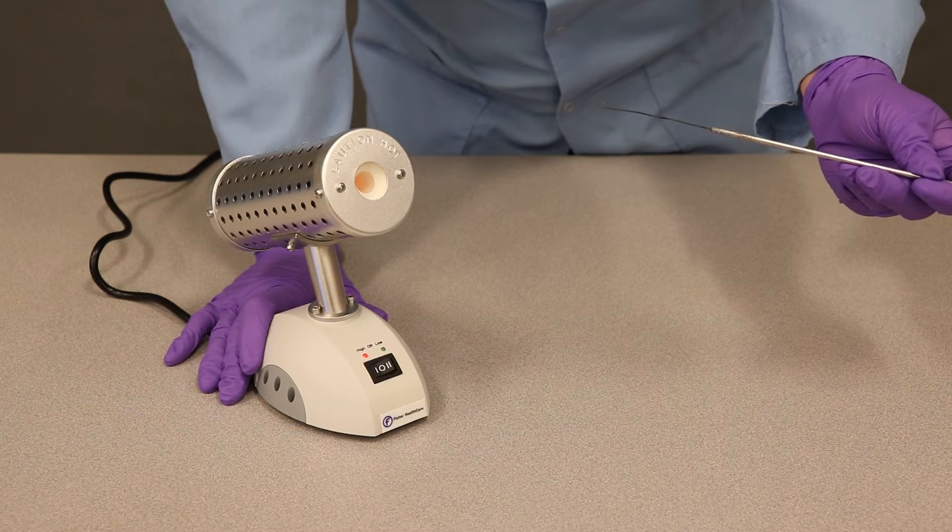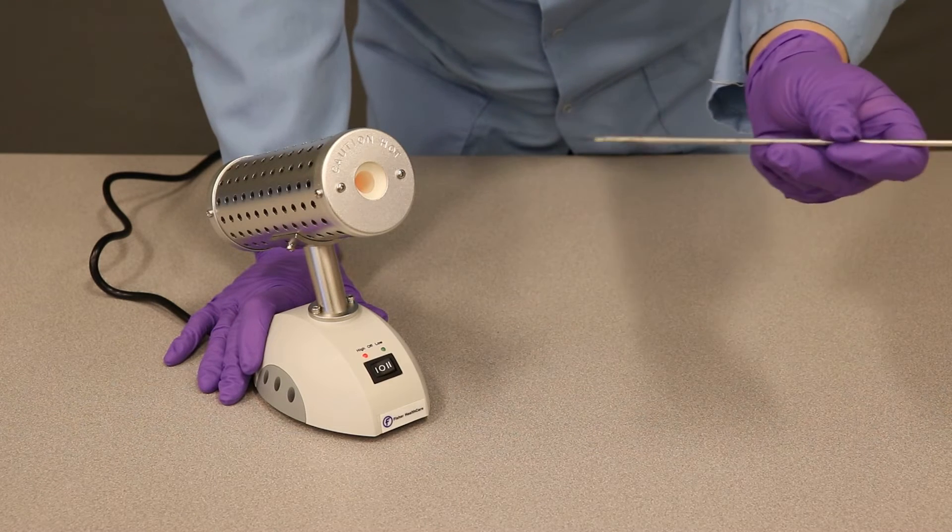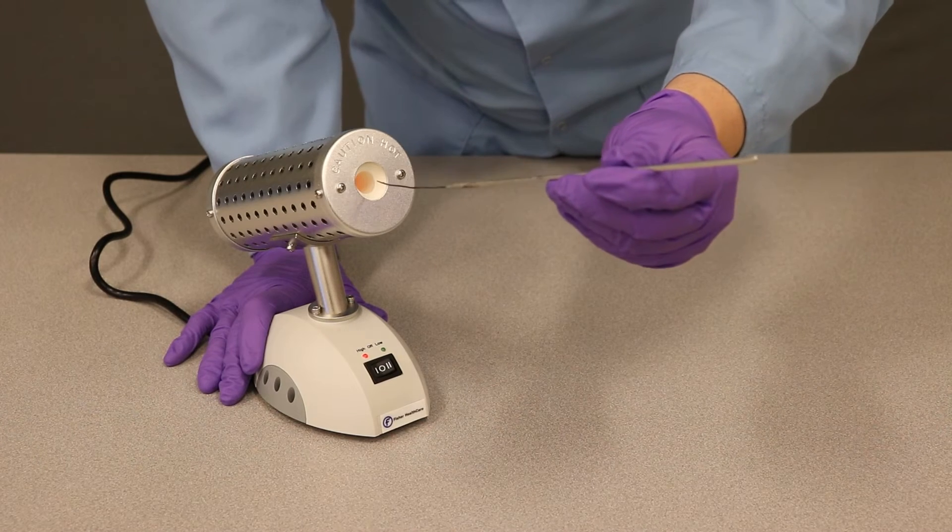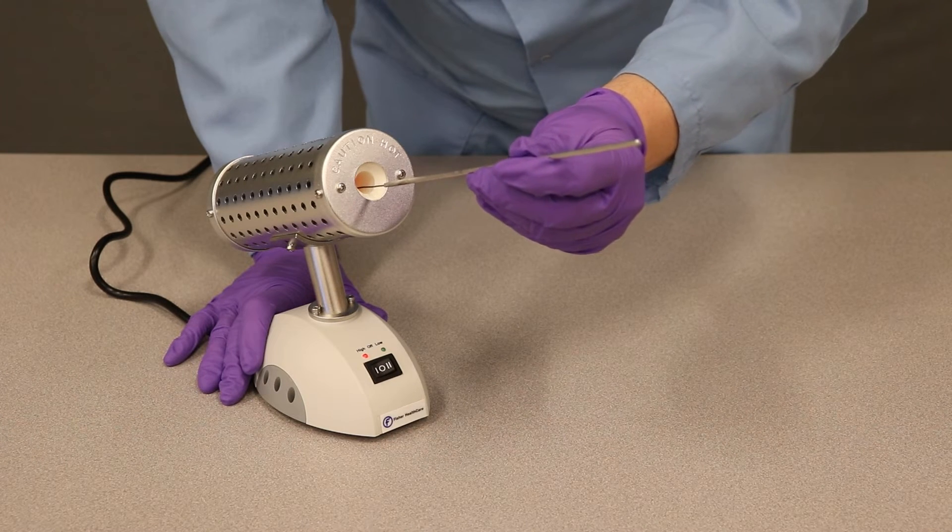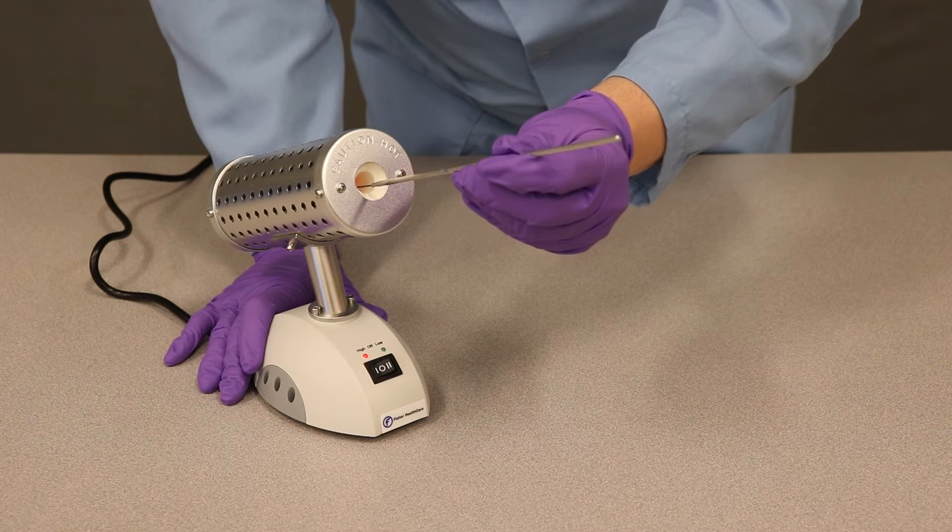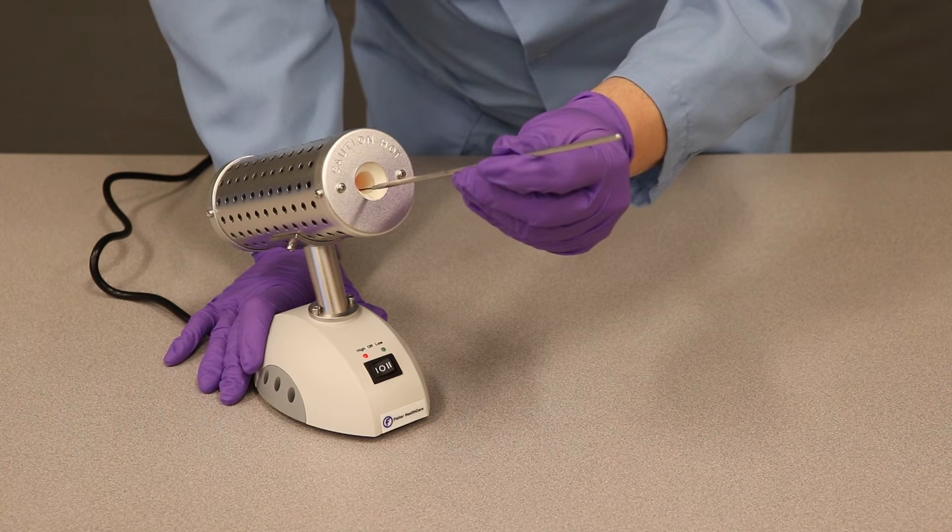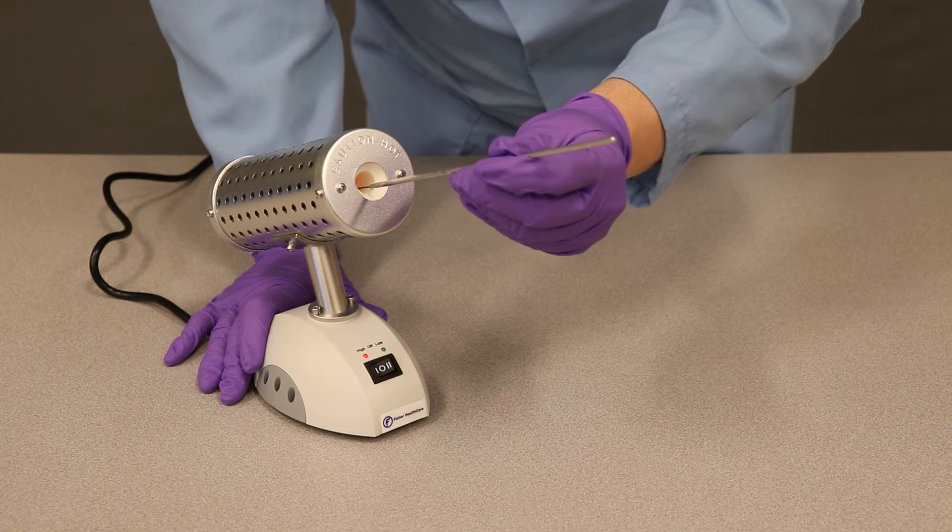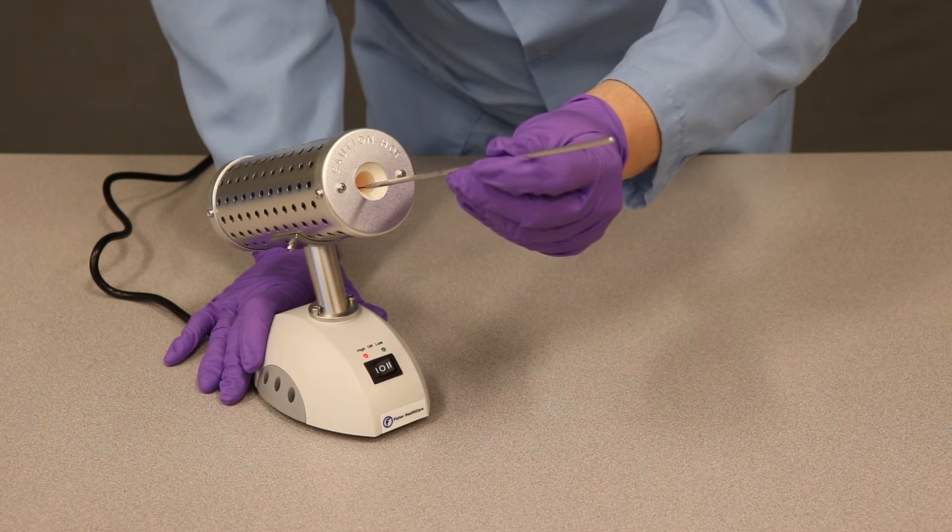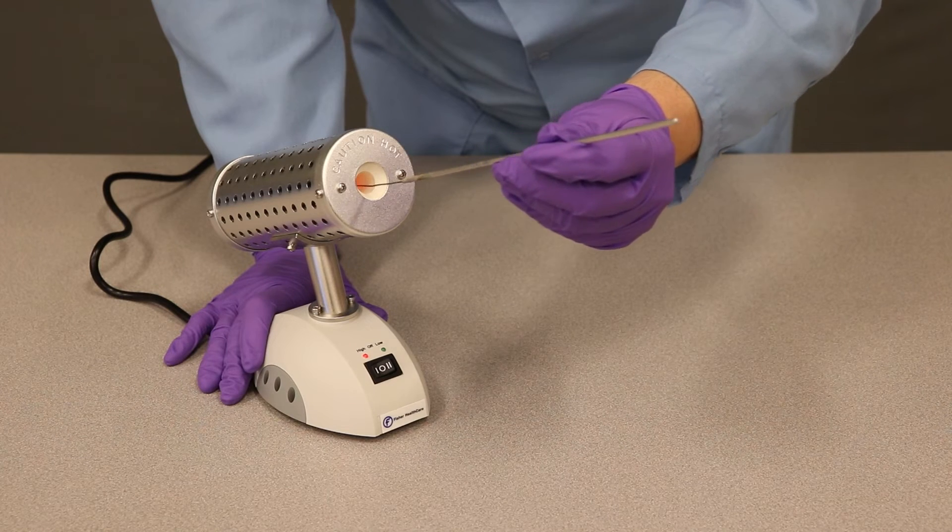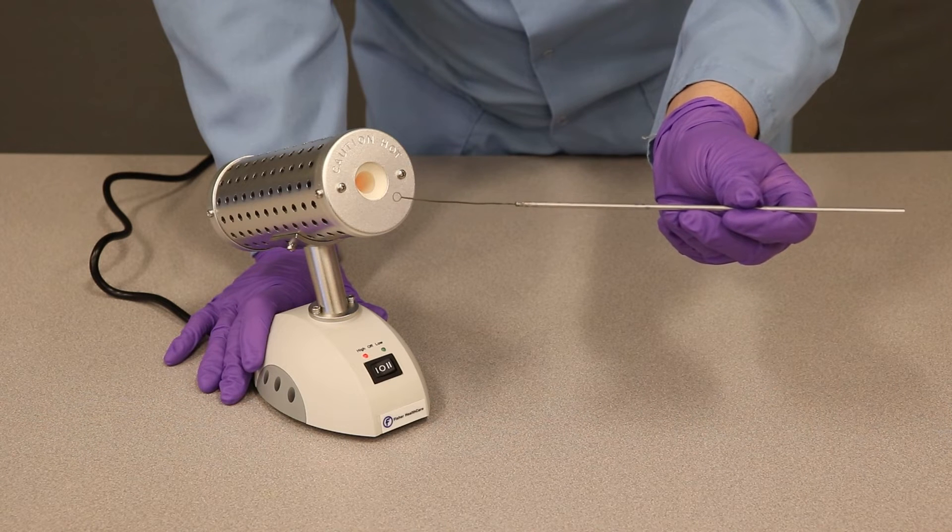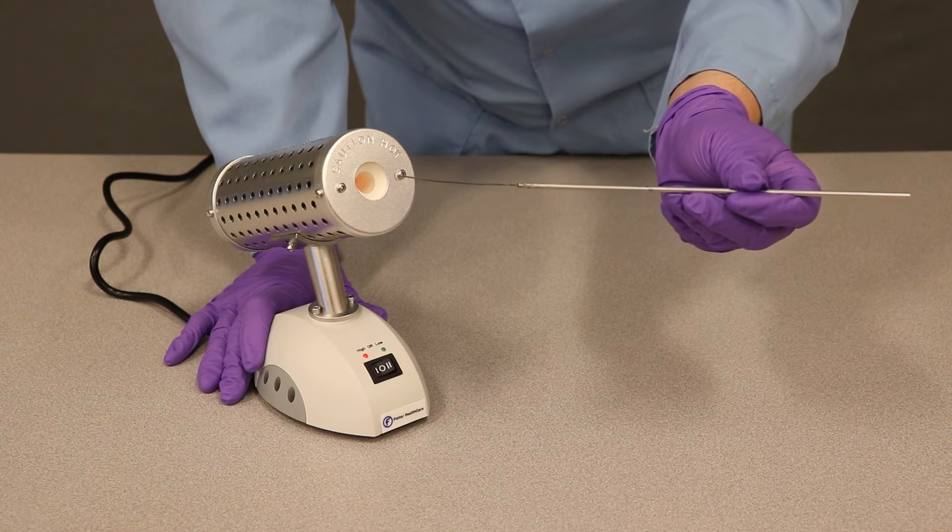When the Bact incinerator is heated up, you can take your inoculating loop and insert it into the main central section. You want to make sure that you do not scratch the sides of the mantle because that can also wear out the mantle. You leave the loop in there, making sure you push it as far into the back of the chamber as possible for about five seconds. Unlike a Bunsen burner, you do not need to have the wire glow to know that it is incinerated.